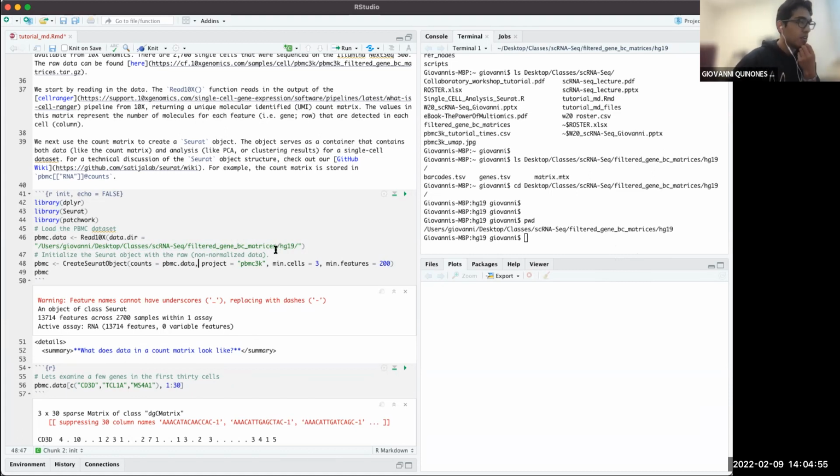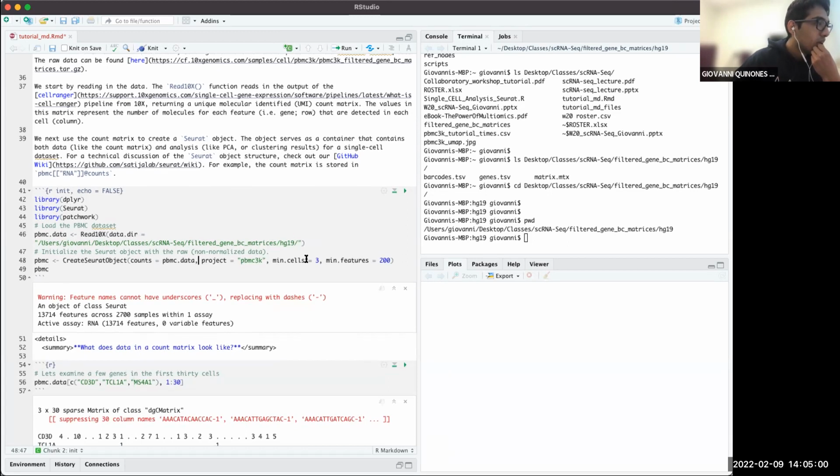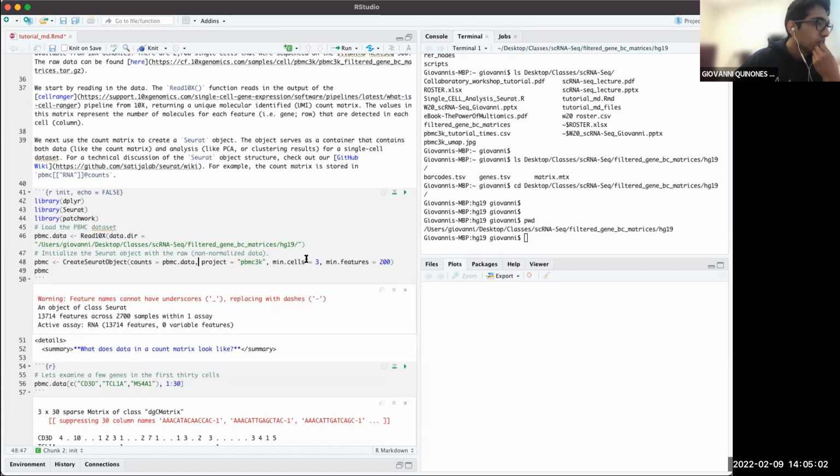We have quite a lot of material to cover. Is there anybody who would like just one more minute to figure out this first part? Everything after this should be much easier, I believe. Okay, so we should get moving on.